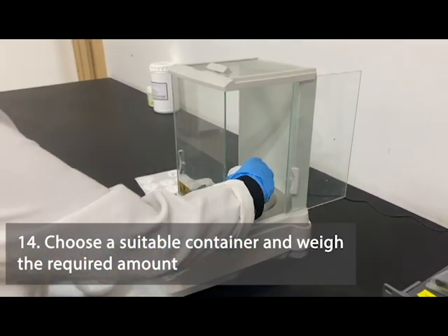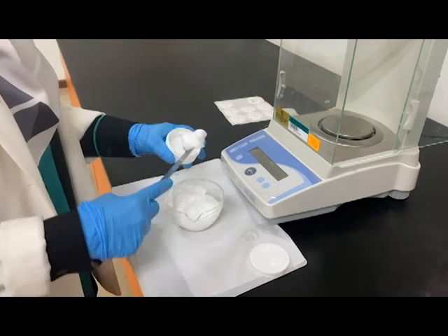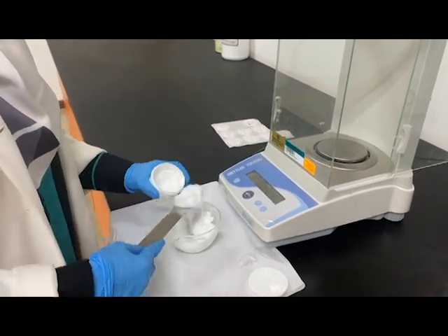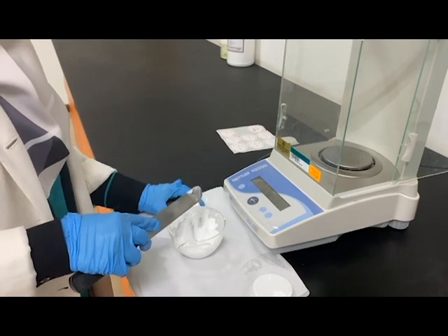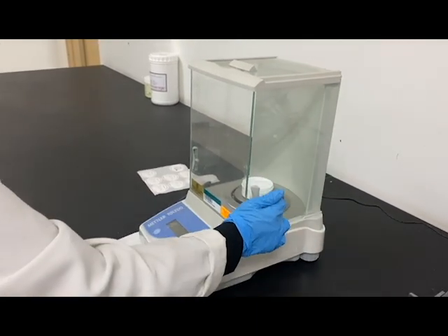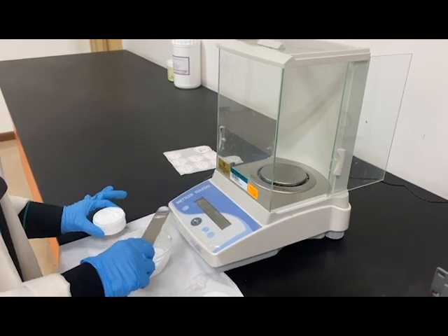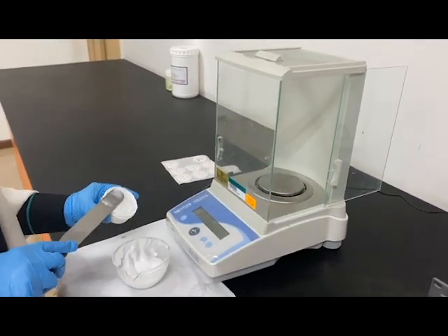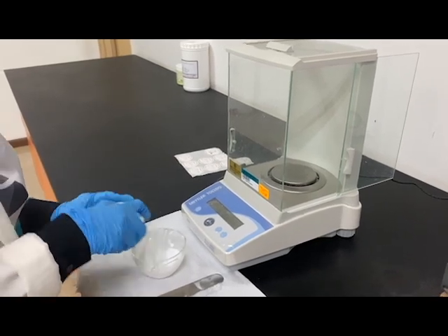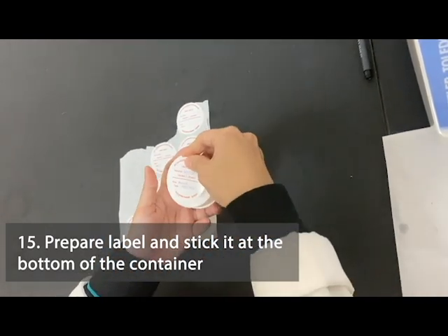Choose a suitable container for your preparation and weigh the required amount. Last but not least, be sure to label your preparation completely according to the prescription and stick it properly at the bottom of the container.